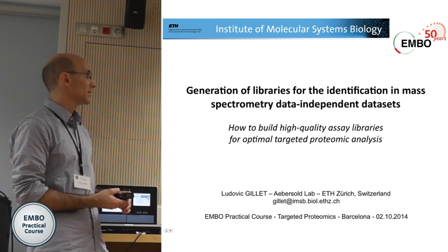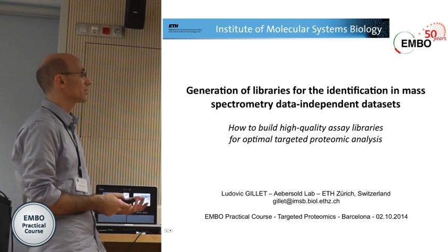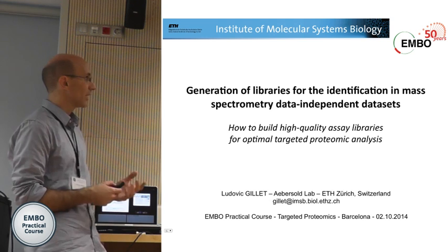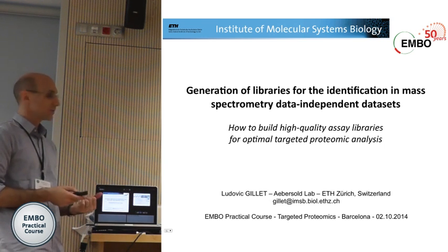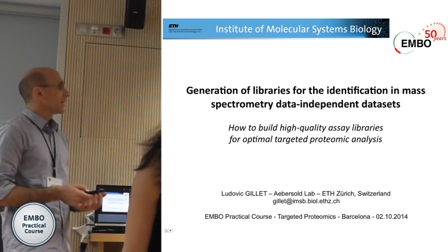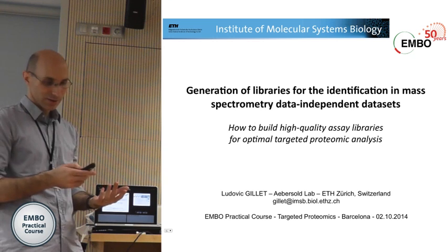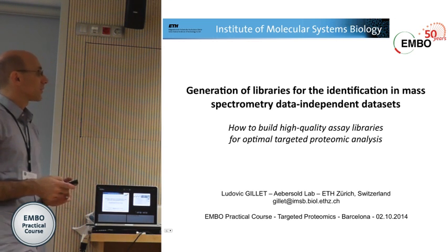And you can even apply this in principle to spectra searching, if you use spectral library searching for shotgun data. So most of these considerations are important for any type of spectral library matching that you would do, either for shotgun, SRM, or SWATH. As soon as you want to have accurate retention time information, relative intensity, etc., this is, I think, a very important consideration.